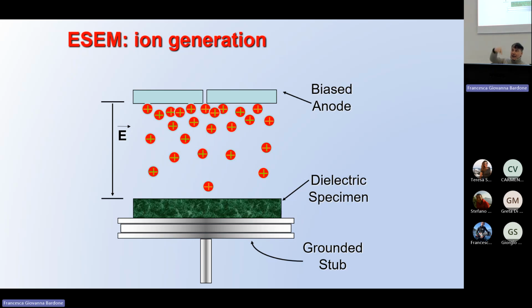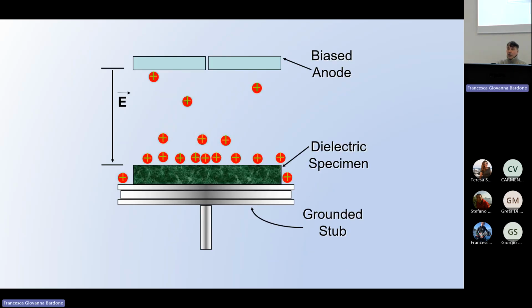And the electron beam is hitting the surface. So automatically, the water molecules or the gas molecules, which are ionized, go to the surface, take away the electrons, and become neutralized dynamically.